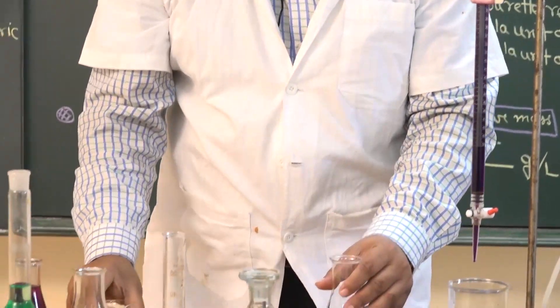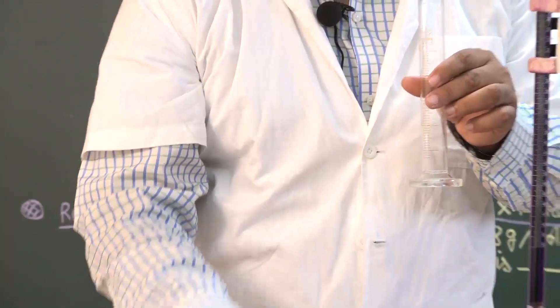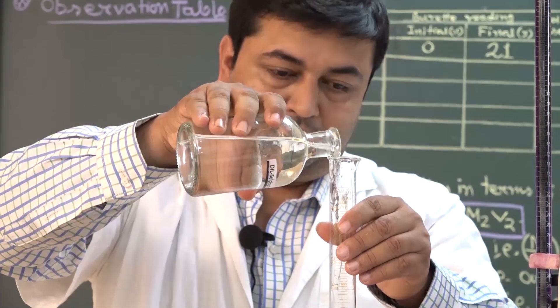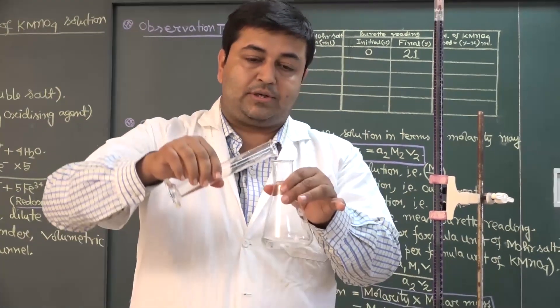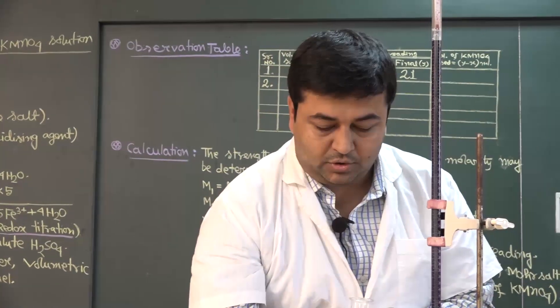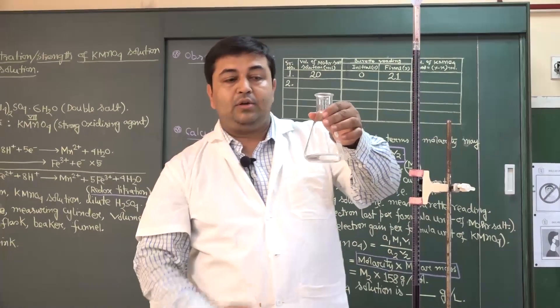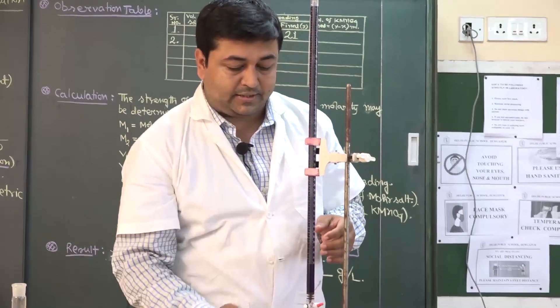Now add 20 ml dilute sulphuric acid using the measuring cylinder. I am adding 20 ml dilute sulphuric acid to this Mohr's salt solution. So in the conical flask we have 20 ml Mohr's salt solution taken using the pipette, and 20 ml dilute sulphuric acid. In the burette, potassium permanganate solution is present. Now I will start the titration.